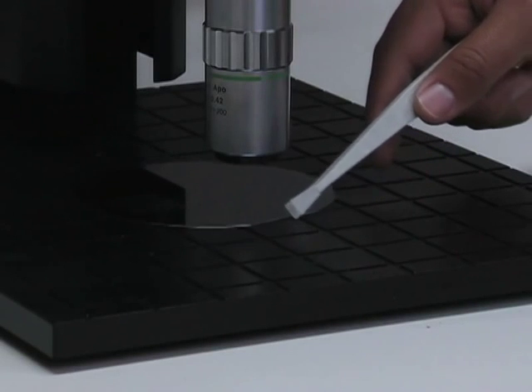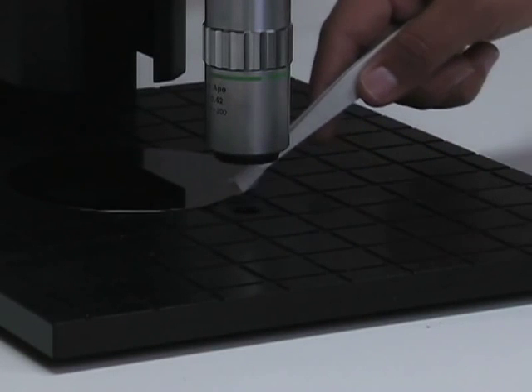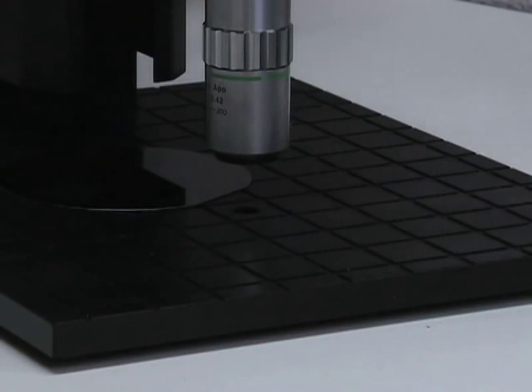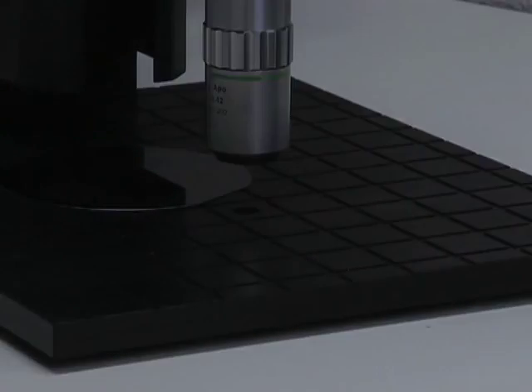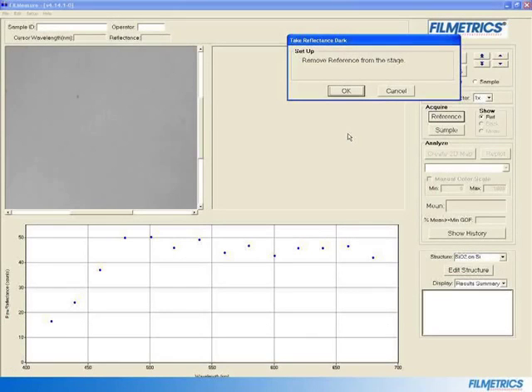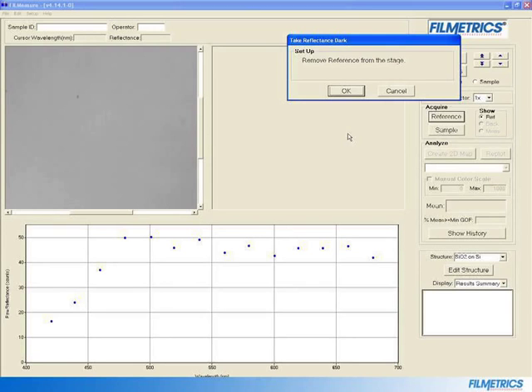Now move the wafer off of the stage. Alternatively, you can hold your wafer at an angle under the objective so that the light is directed away. Then click OK.